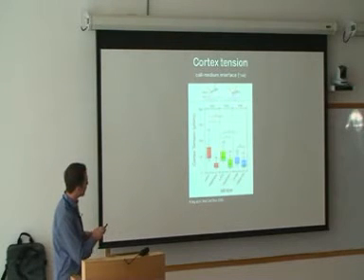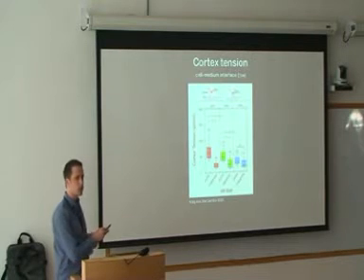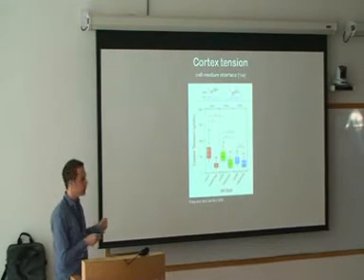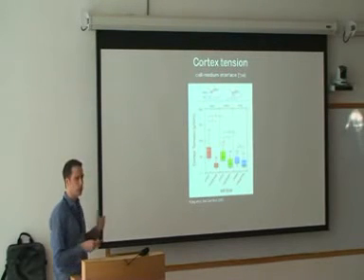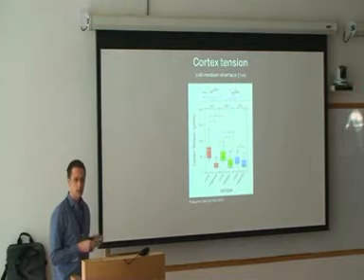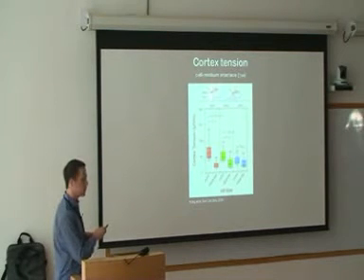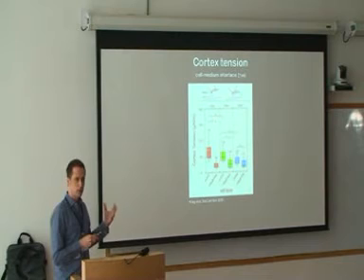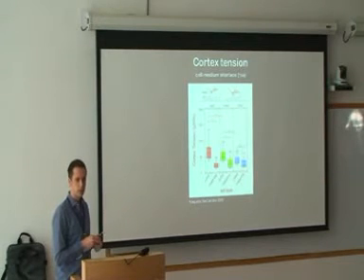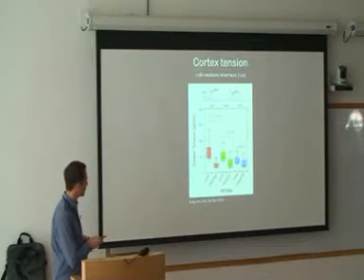And then we are moving down the cantilever with the plastic bead on its tip. And we are moving onto the surface of the cell, we are deforming the cell, we are watching how the cell is deforming, and we are measuring the force which is created by this deformation. And again, what we can then calculate is the resistance of the contractile actomyosin cortex to the movement of the bead trying to deform it. And so what we get from these experiments is a cortical tension, which is the cortical tension at the cell-medium interface of single progenitor cells. And we can do that for ectoderm progenitor cells, mesoderm, and endoderm progenitor cells.